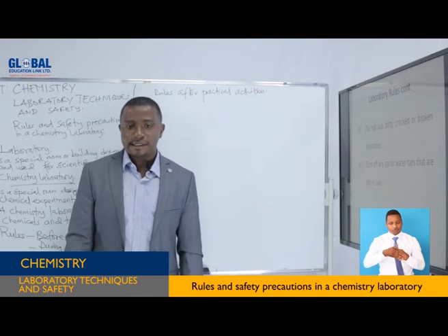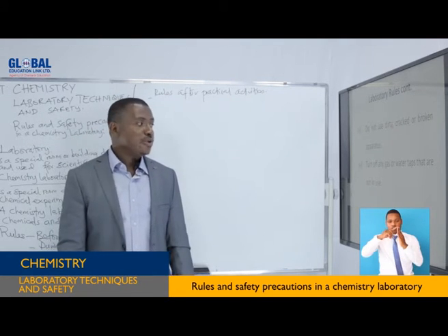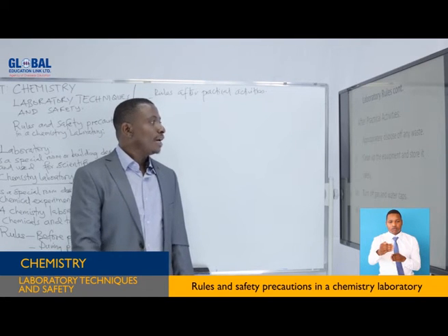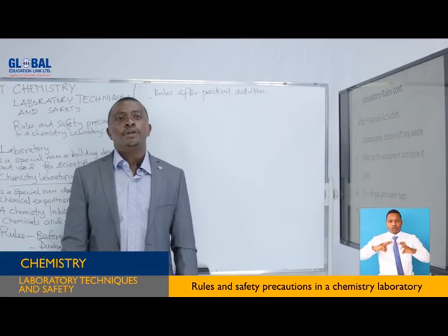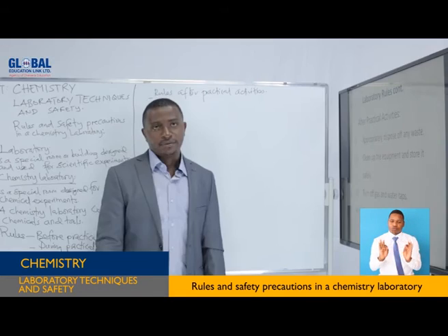Now, let us see some of the rules that apply after practical activities. You have now done your experiments, you have now performed your practical activity. Now, what should you do? After practical activities, number one, appropriately dispose of any wastes.